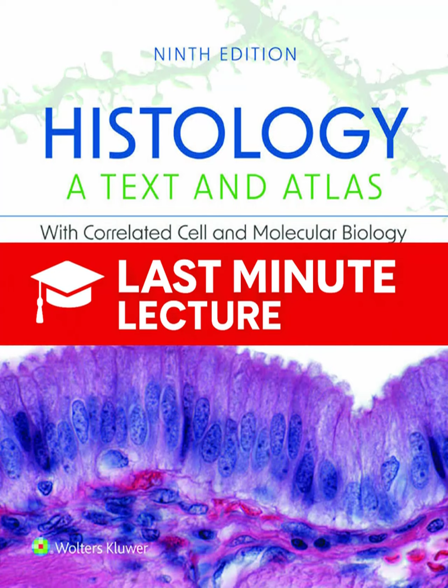And the same principle can be scaled up to much higher resolution with EM autoradiography. So using an electron microscope. Right. Figure 1.8b is an electron micrograph that lets us see the precise subcellular location of these tagged molecules. The silver grains are much smaller, and you can see they're concentrated right over the apical invaginations and endosomal tubules in an intestinal cell. It's crucial for tracing the exact intracellular pathways of specific molecules.